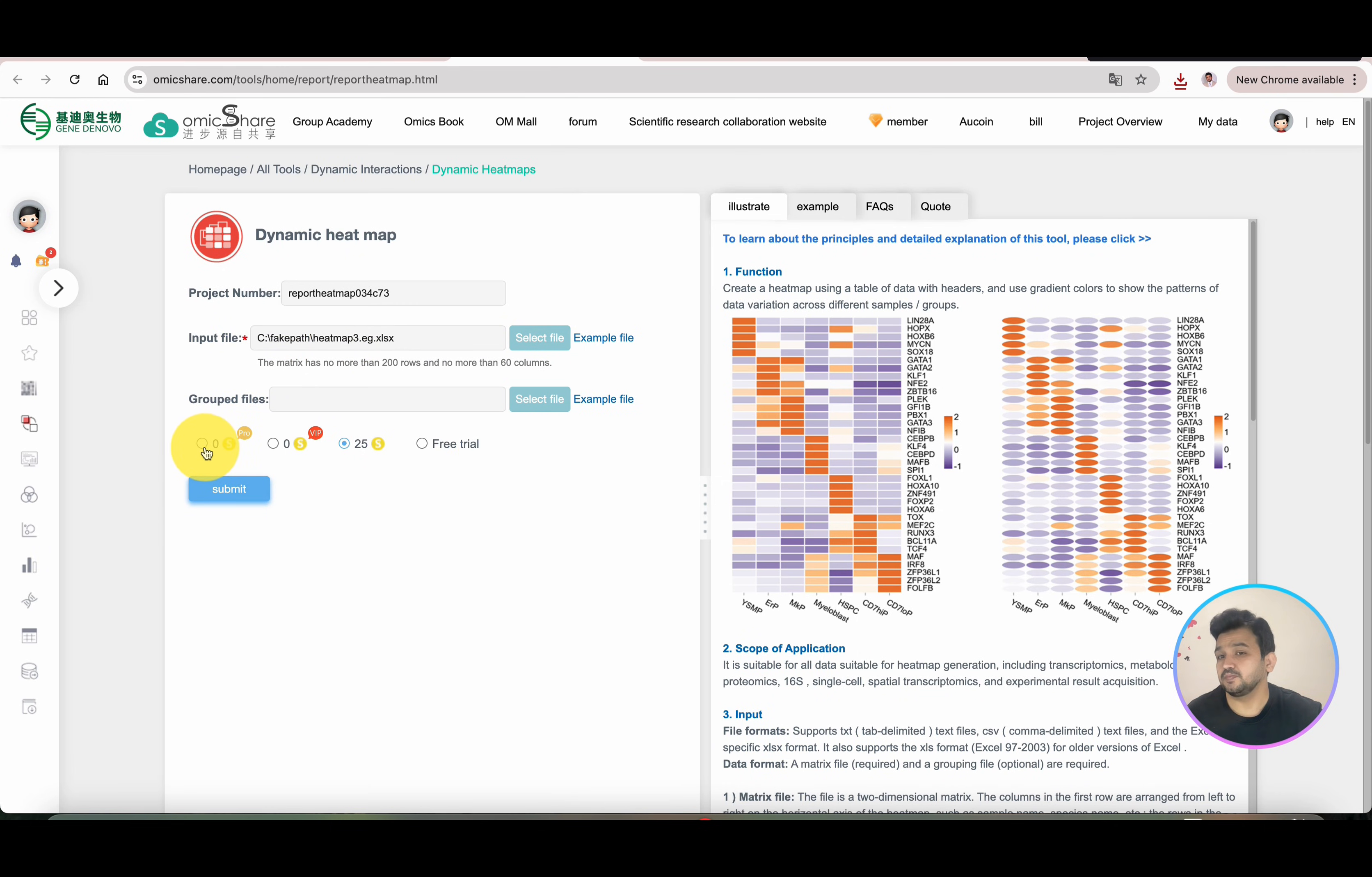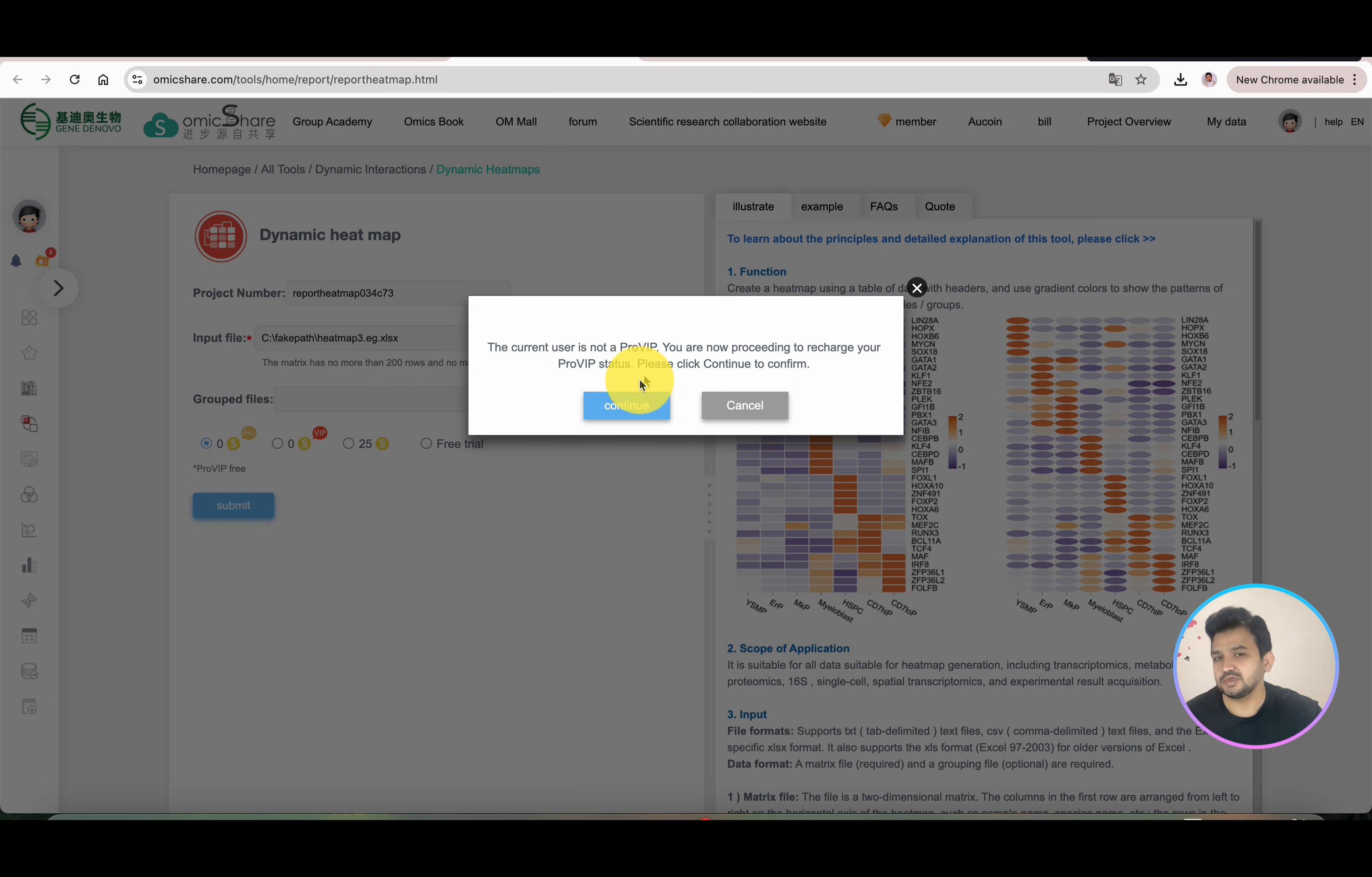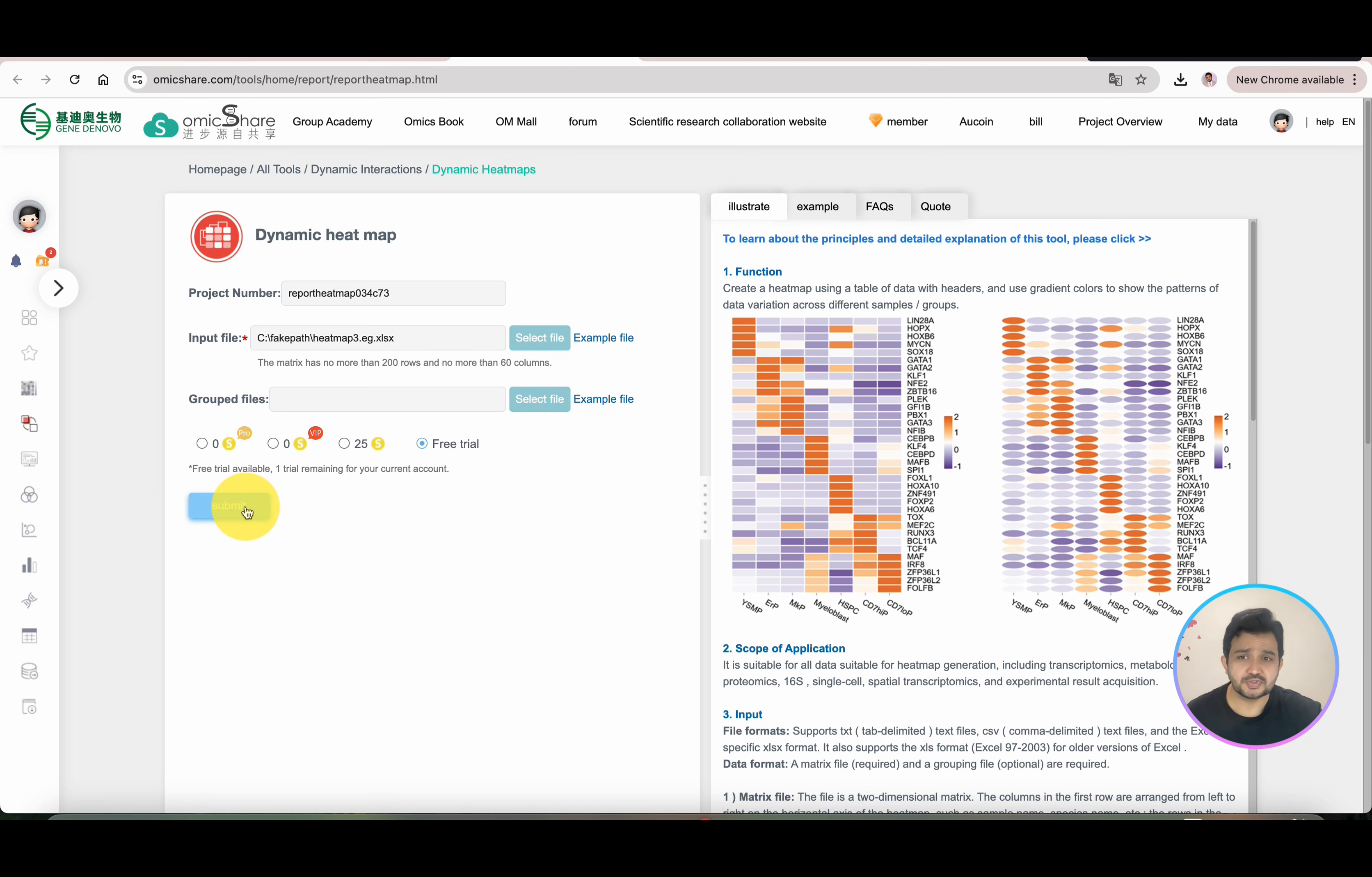Once you click, it will ask you what you want to do. OmicsShare works on the credit system. This is free, but you need Pro membership. Once we click on the Submit option, you can see the current user is not a Pro VIP, so you're proceeding to recharge your Pro VIP status. You can recharge, but if you're a new user, they will give you 50 points for free and you can perform two free trials. As you can see, the free trial is still available because I've used one already. I will simply click on this Submit option, and later I will show you how to purchase credits.